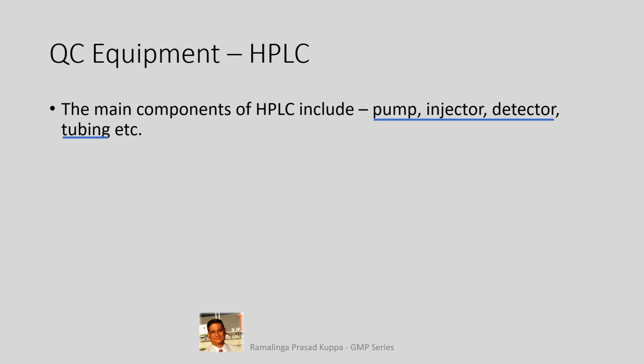See and understand the design of the Rheodyne injector. It is really a wonderful design. Check the path on how the loops are designed while in load position and in inject position. Really very interesting.